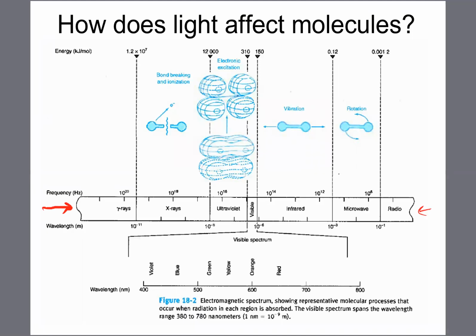All right, so right here in the middle, we see names of different types of electromagnetic radiation. These are different classes or categories. Now, what's most familiar to us is right here. If you can't read that, it says visible, sideways. That's the light that we can see with our eyes, the visible radiation. Now, it's like the Roy G. Biv spectrum. Notice that's only a tiny little sliver of the entire electromagnetic spectrum, and this x-axis is not even drawn to scale.